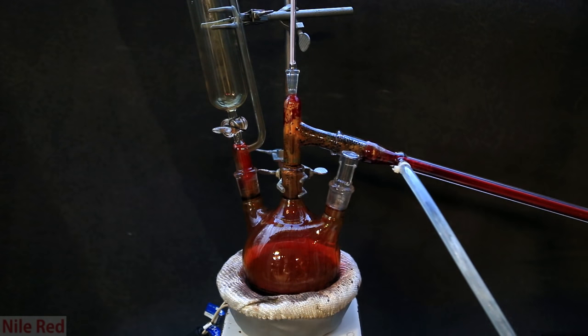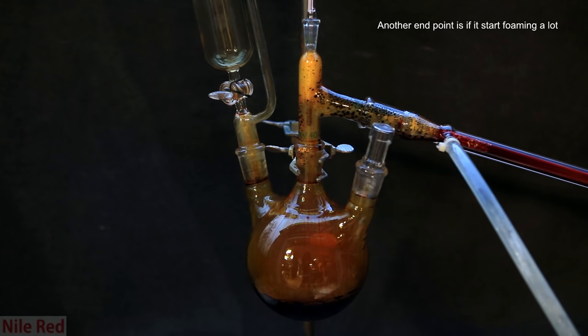As we continue to boil it, you'll start to notice a yellow color appearing, and the red color diminishing. At this point, the distillation is done, and we can take it off heating.